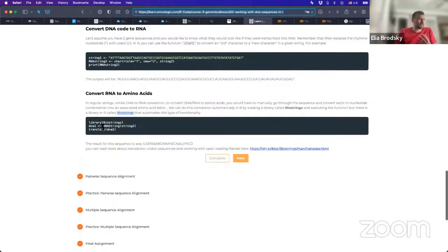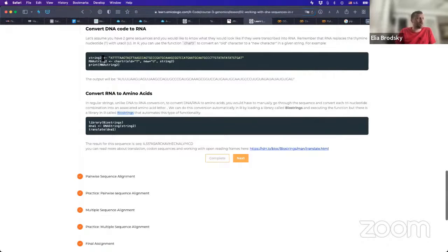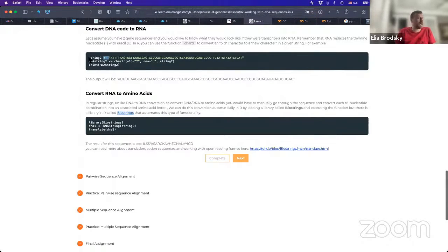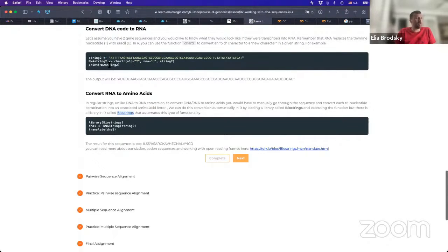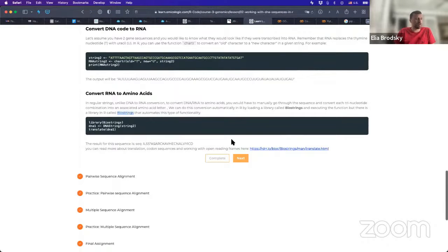So for example, here we can load a string. In R, we use this symbol to equal, to assign it to a particular object. And then you can see that we can perform different functions, printing, comparing, converting, etc.